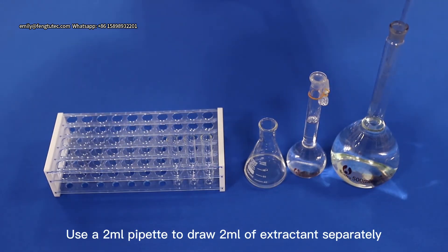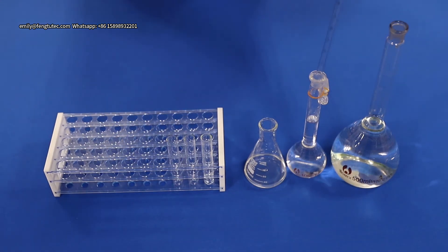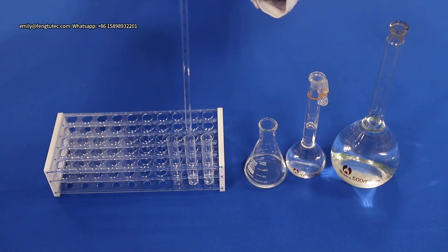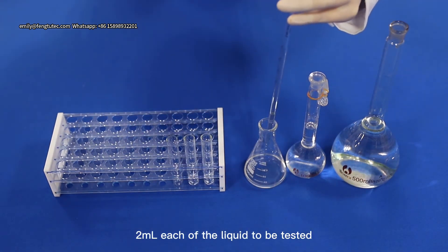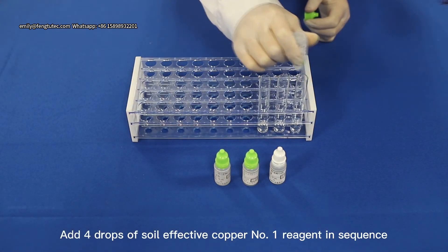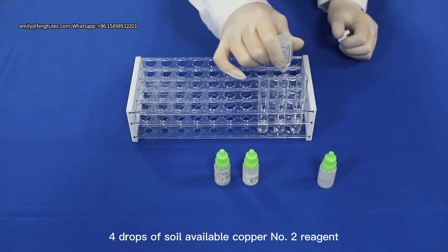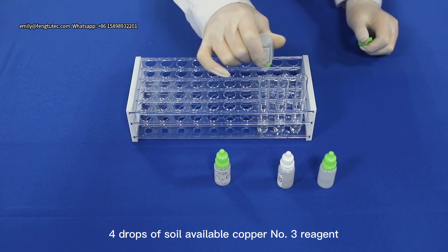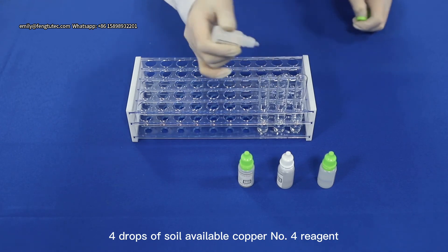Use a 2ml pipette to draw 2ml of extractant as blank solution, 2ml of standard solution, and 2ml of the liquid to be tested. Place each in 3 small reaction flasks. Add in sequence: 4 drops of soil available copper reagent number 1, 4 drops of number 2 reagent, 4 drops of number 3 reagent, and 4 drops of number 4 reagent.